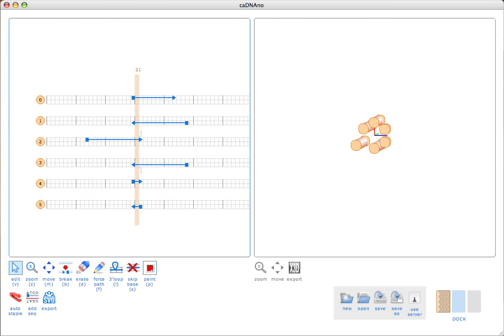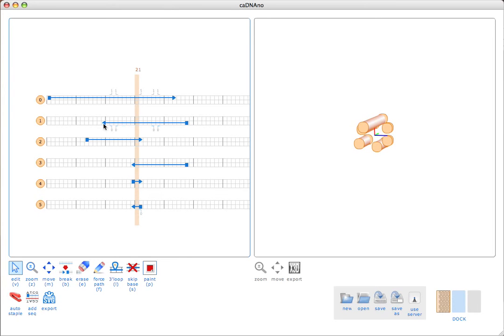Our goal is actually to choose a continuous route for the scaffold path and then generate a list of staples that will force the scaffold to adopt that configuration in the test tube. We can extend the scaffold in a few different ways. We can drag these breakpoints back and forth, or we can option-click on the breakpoints in order to send them to their extreme boundary.